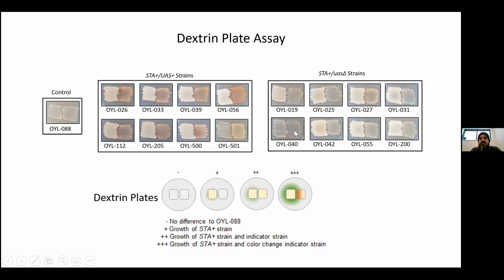We actually later found that 040 has what looks like a mutation in the glucoamylase gene itself that inactivates that gene. So it's not diastatic, even though it comes up as STA1+ genetically. Which, as an aside, shows you another weakness of the genetic tests, because they're not differentiating between a broken version of the STA1 gene versus one that produces a functional glucoamylase. But this assay, which depends on cross-feeding, will tell you whether you have one that actually works.